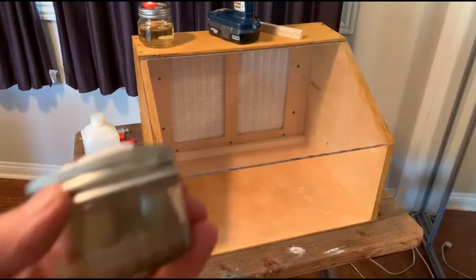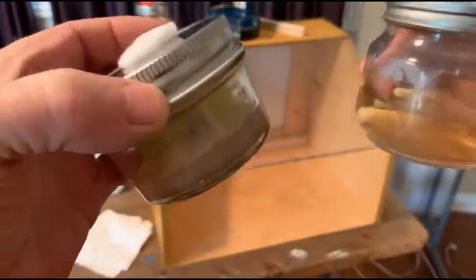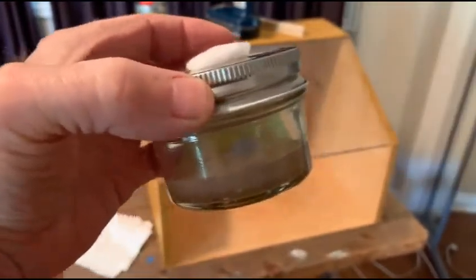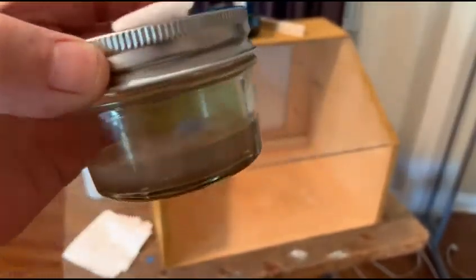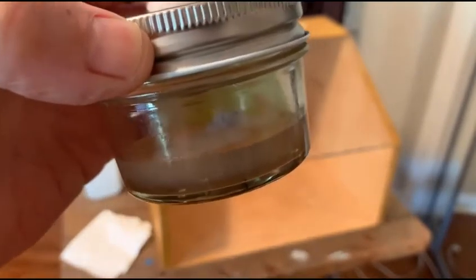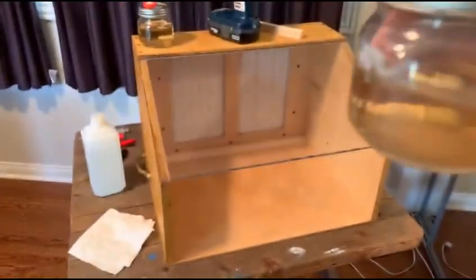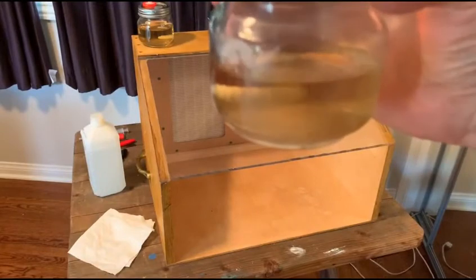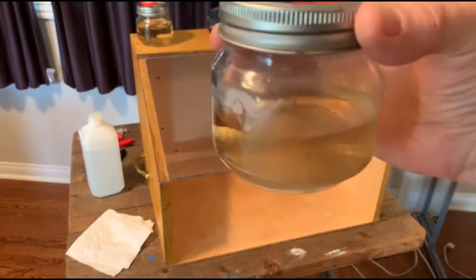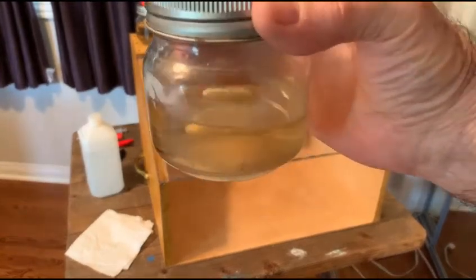Greetings, Dave here. Today I'm going to do a transfer of mycelium from an agar plate. It's Agaricus bisporus, which is the common white mushroom you find in the supermarket. I'm going to transfer that mycelium into a liquid culture, because I want to then transfer the liquid culture into a substrate bag to grow the mushrooms.